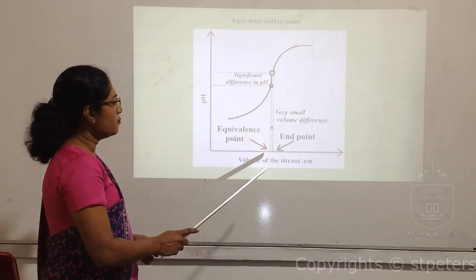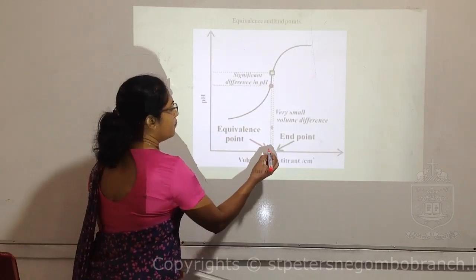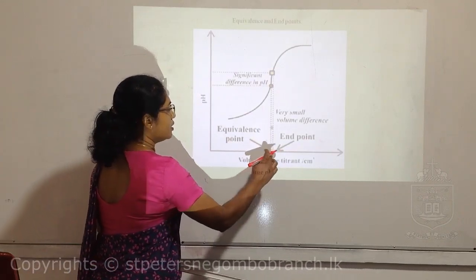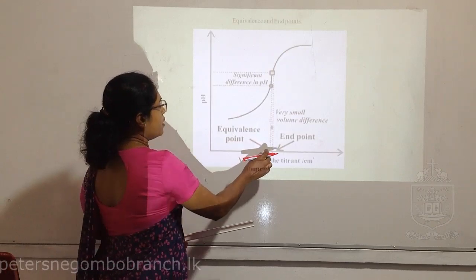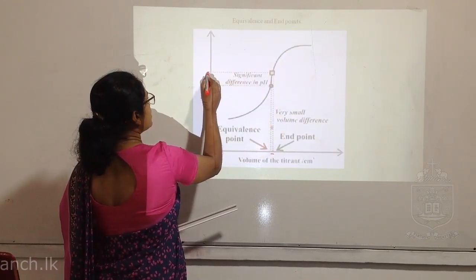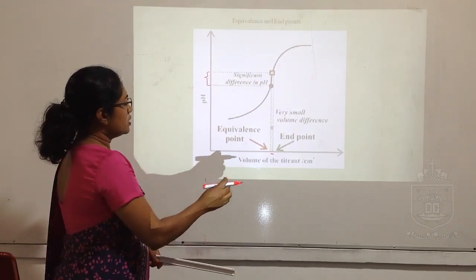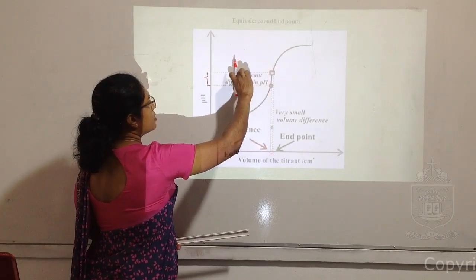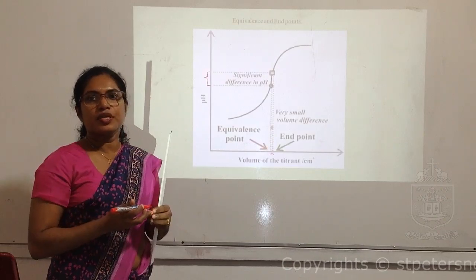You can see there is a very small difference between these two volumes, but it makes a significant pH change here.